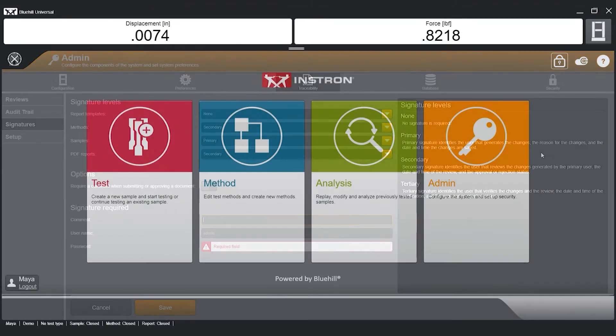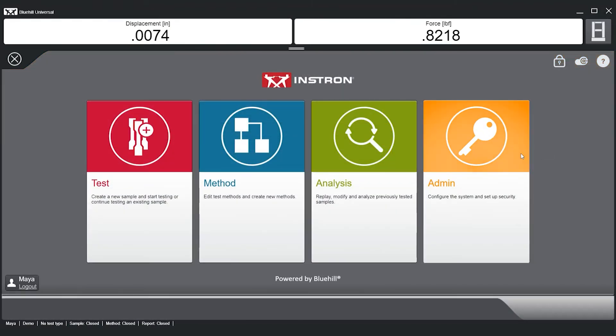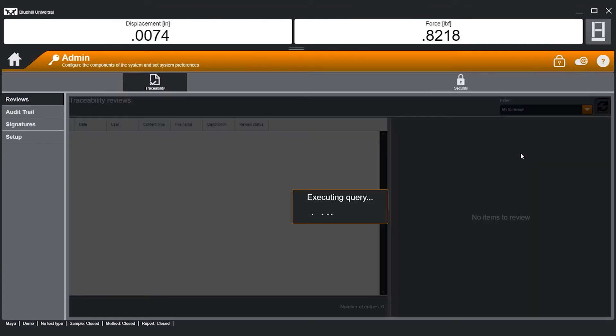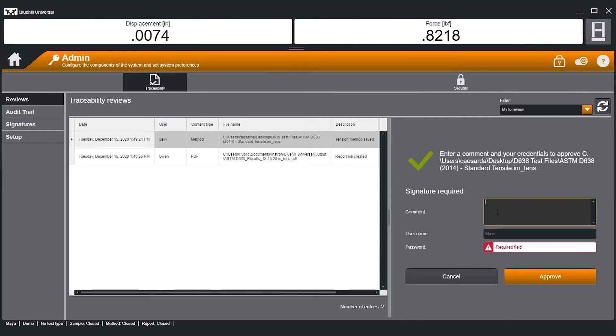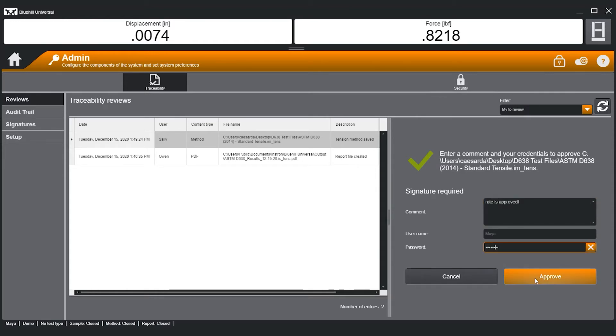During everyday use, files that are pending review will appear in the Traceability's Review section. Depending on the current user's level of signature permissions, the user is able to review the item and approve through password authentication.